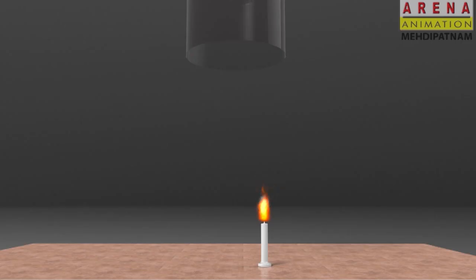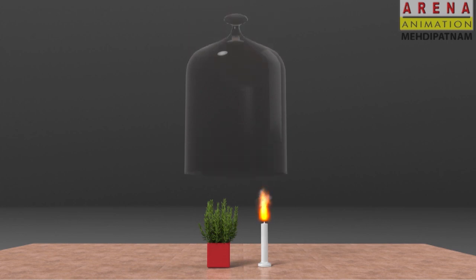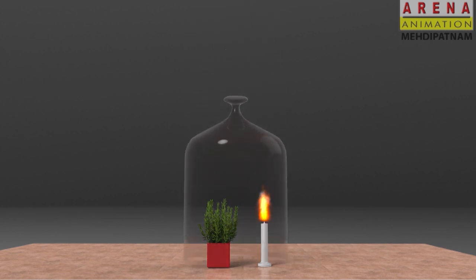Experiment 2. Light up the candle first. Place a mint plant beside the burning candle. Now keep the bell jar above both of them as shown in the video. The light of the candle continues burning without any interruption.